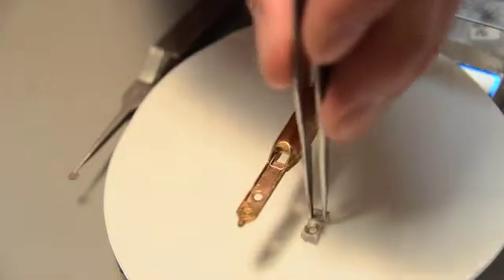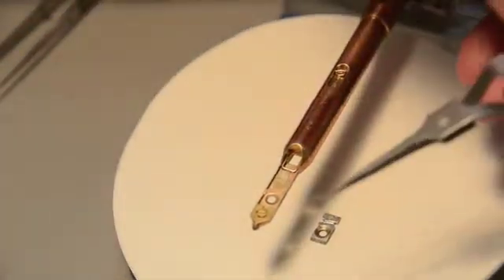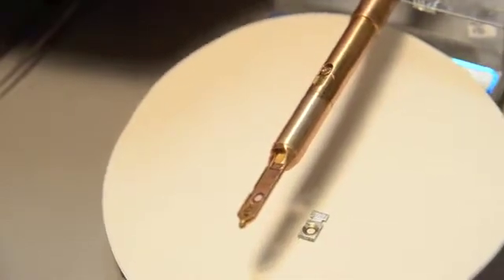Gently remove the aluminum retainer with the same forceps and place it on the clean filter paper. Now place your TEM grid into the grid hole, sample side up, and tap the rod if necessary to position the grid properly.